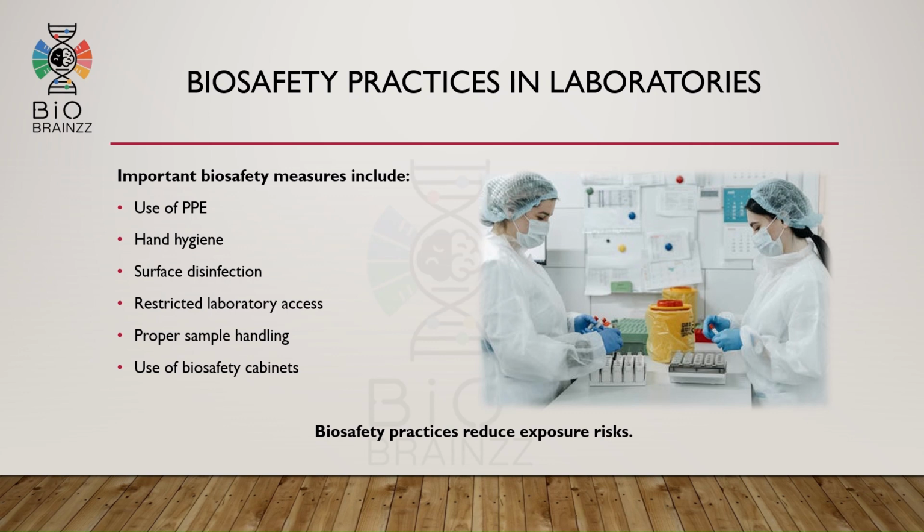Important biosafety practices include the use of PPE, proper hand hygiene, regular surface disinfection, restricted laboratory access, and correct sample handling procedures. Biosafety cabinets are also used while handling infectious materials. These practices reduce exposure risk and maintain laboratory safety.